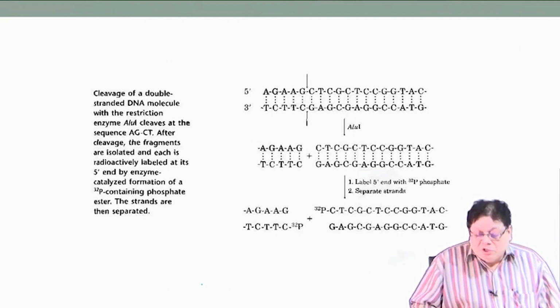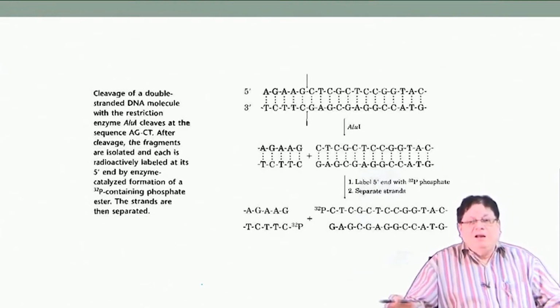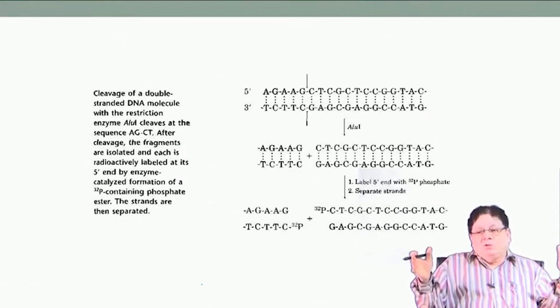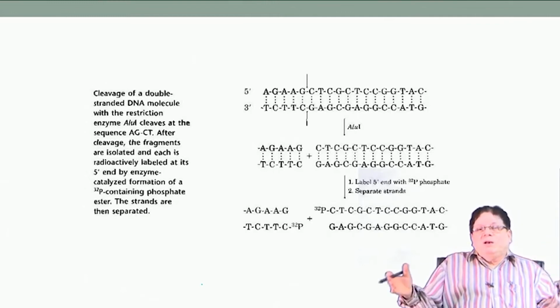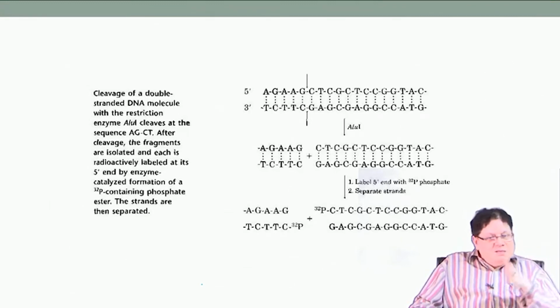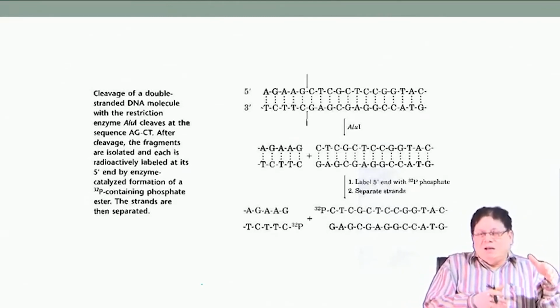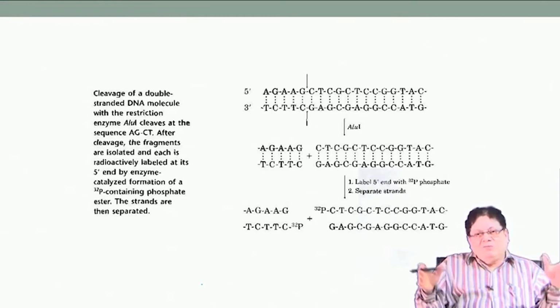Now, to start with, for base sequence, what you need to do, because DNA is a very large molecule, and with a large system it is not possible to get this sequence done. It will be very difficult. In proteins also, when you have a large protein, you chop it into pieces. And what are these choppers? The choppers are basically the enzymes, and then you isolate those small, manageable pieces, and then do the sequence, and finally you do the overlapping sequence and get the full one.